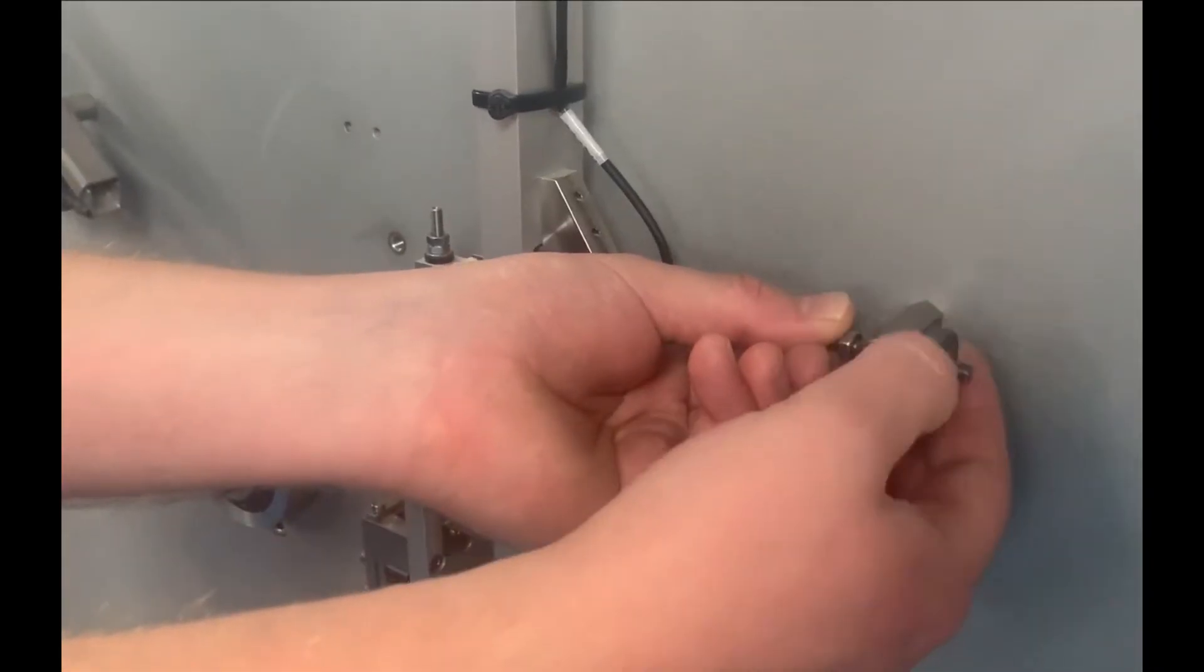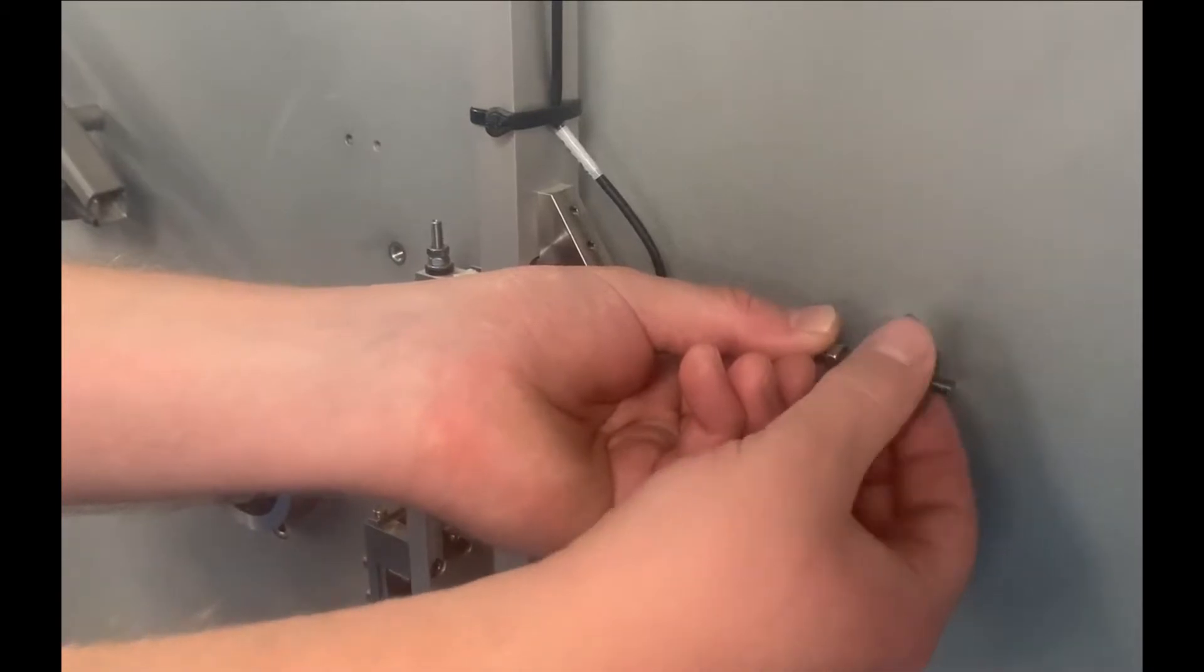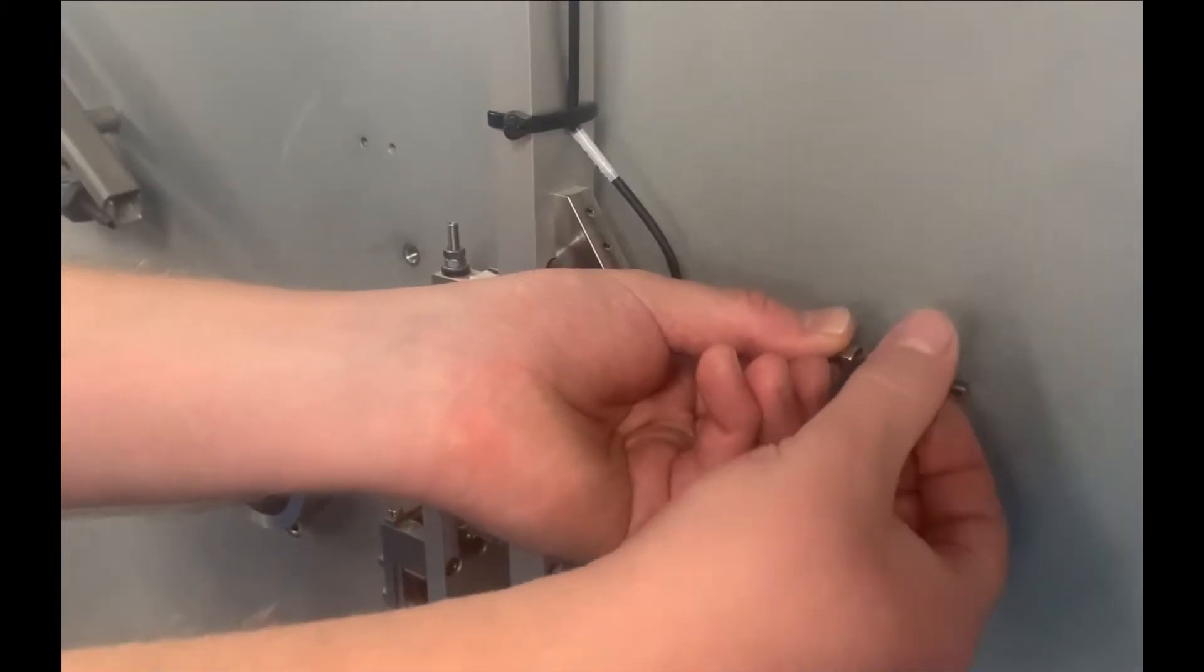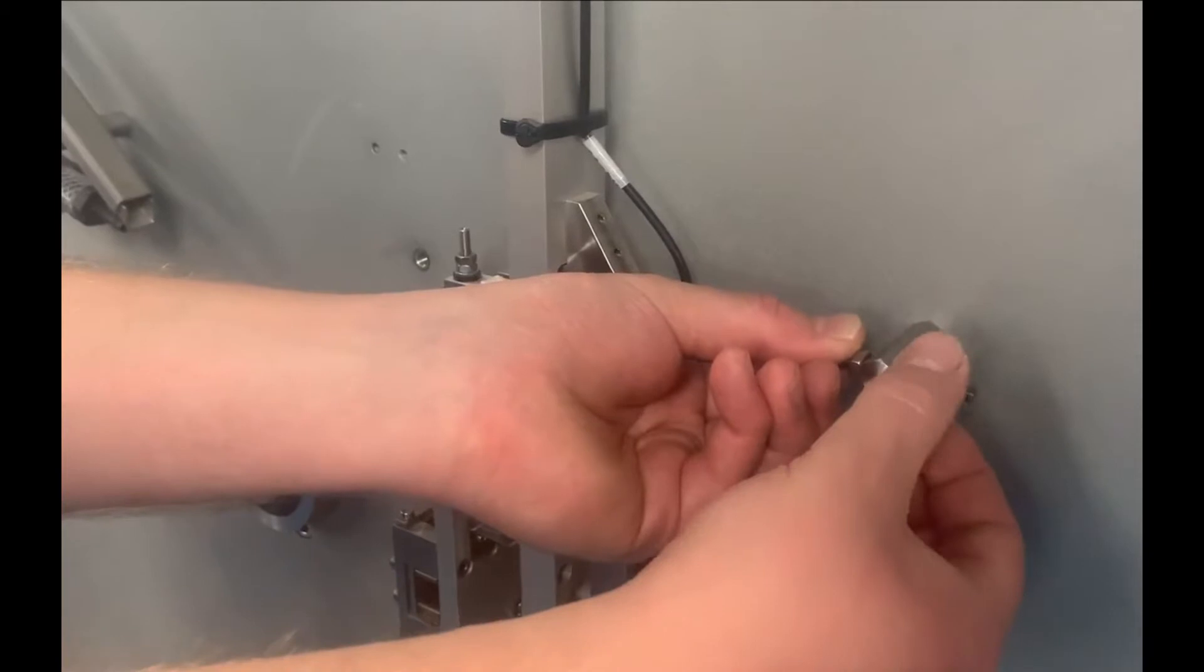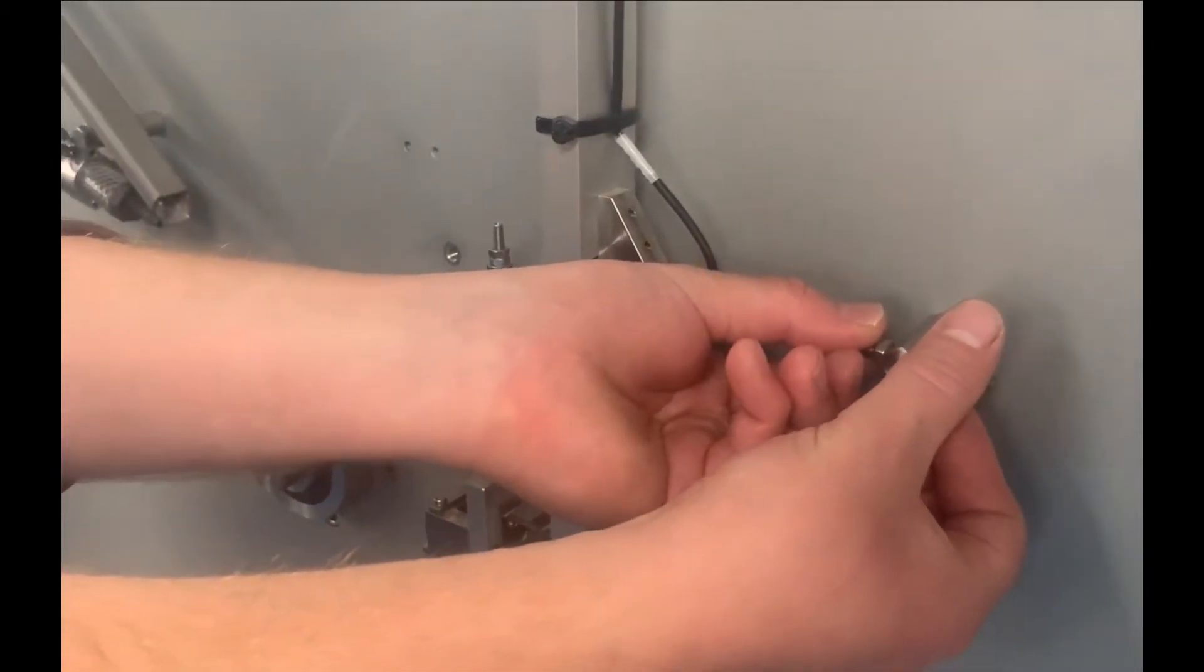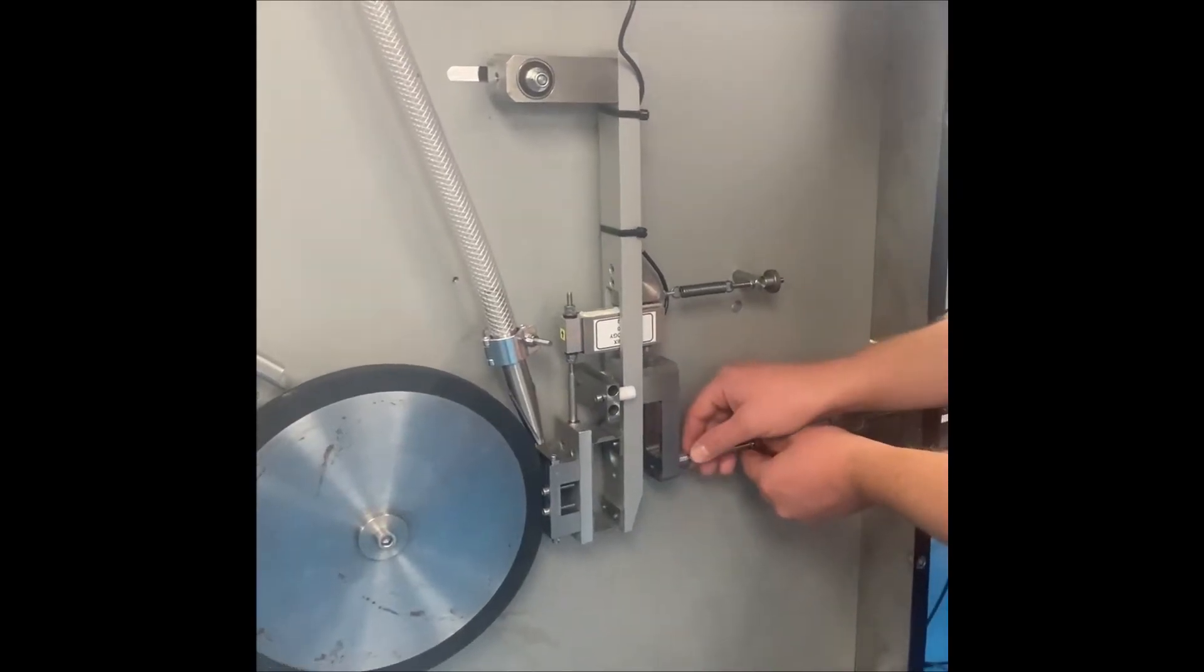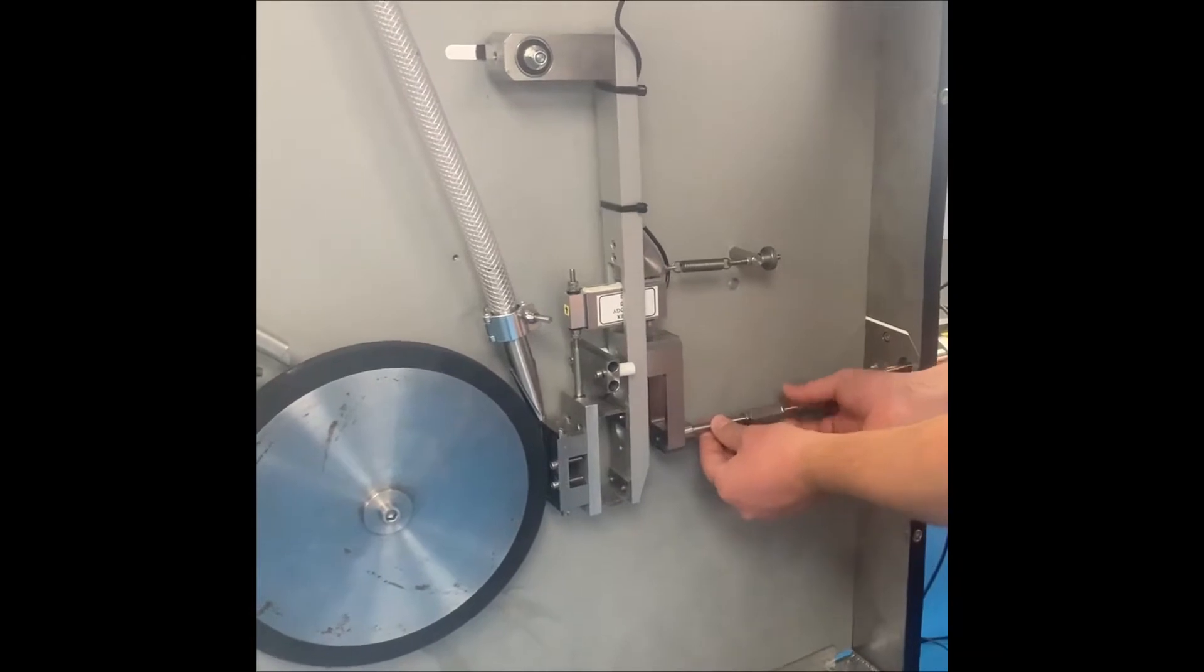Connect and adjust the counterbalance spring so that the load arm hangs vertically with no load on the test wheel. Note that it may be necessary to adjust the position of the load arm pivot in the slot to ensure that the load arm is vertical when the specimen is in contact with the wheel.